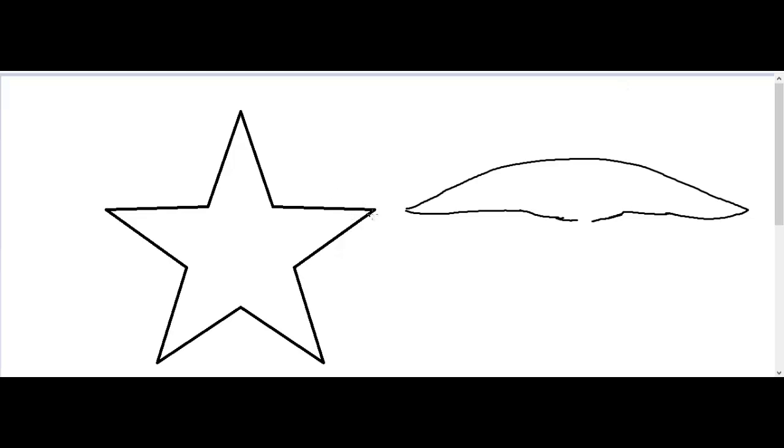Now we are going to focus on the digestive system of the starfish. Here we have the aboral side. That would be the anus of the starfish.